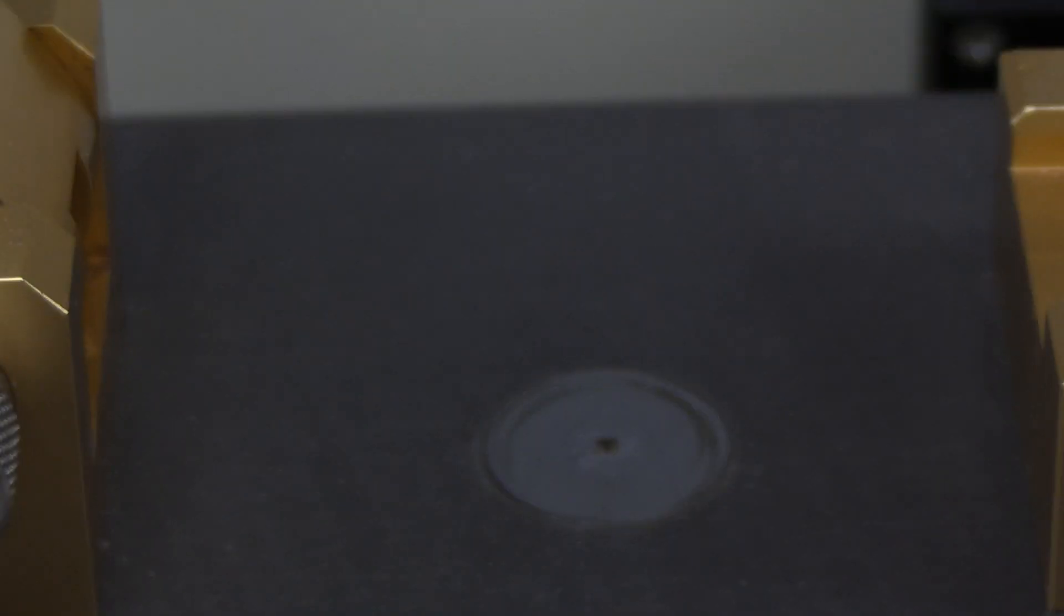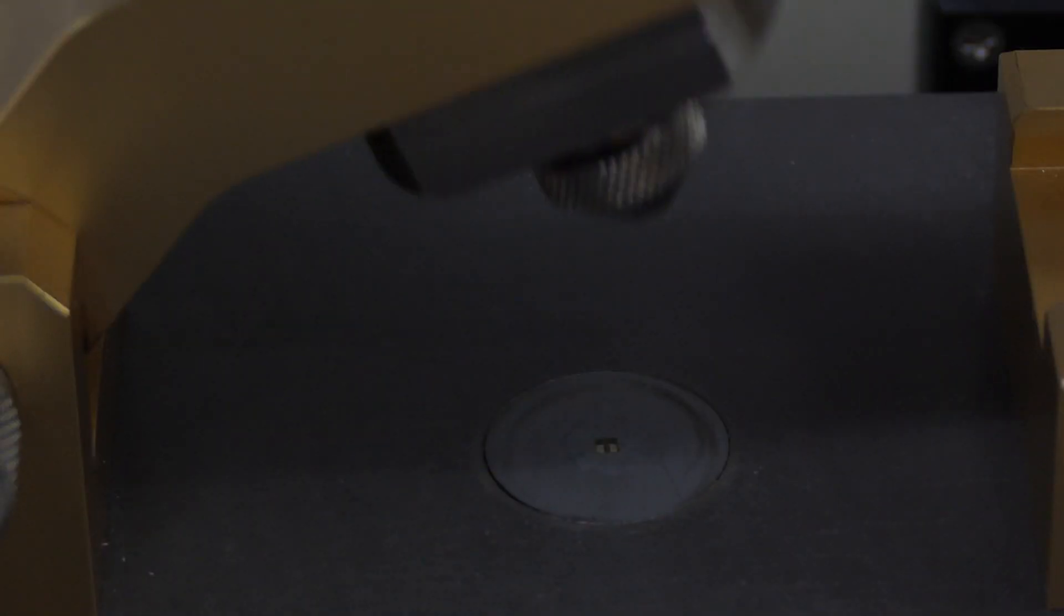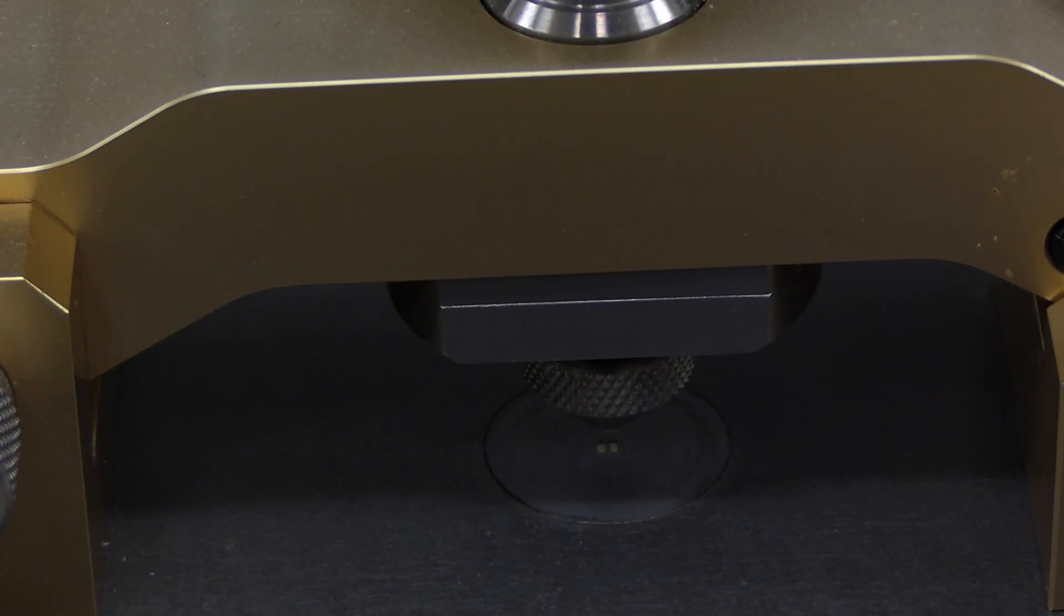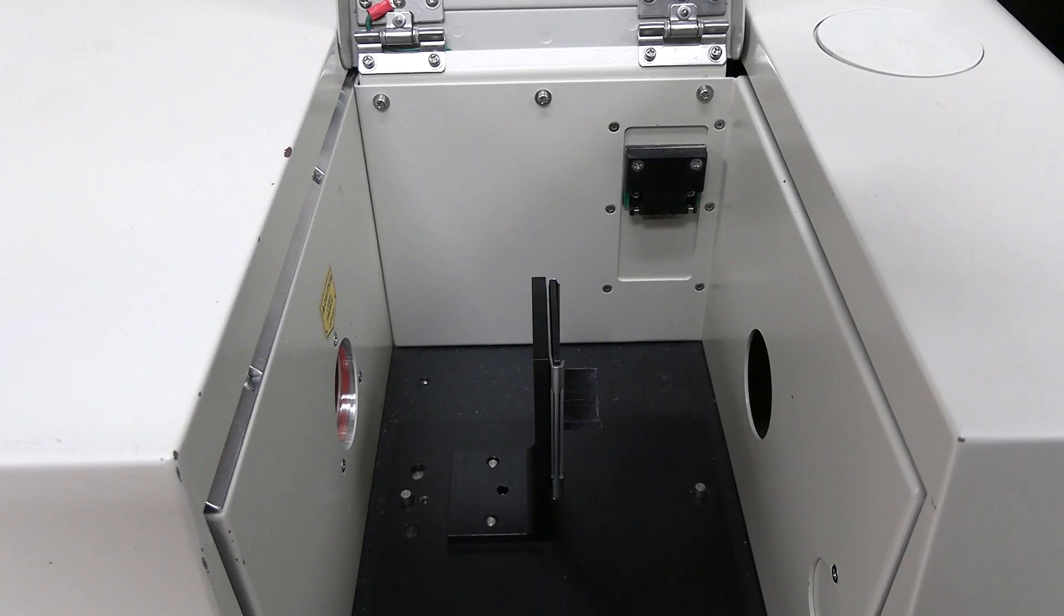Before performing the background measurement, ensure there is no sample in the sample chamber. If using the ATR, there should be no sample on the sample window, and the anvil should be retracted away from the sample window. If using the plate holder, there should be no salt plate on the holder.